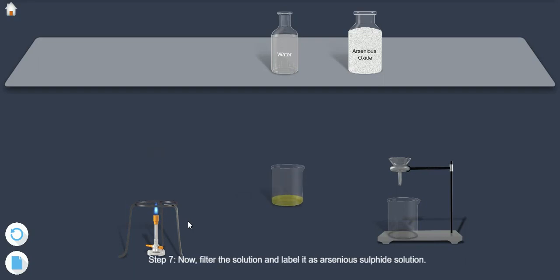Step 7: Now filter the solution and label it as arsenious sulphide solution.